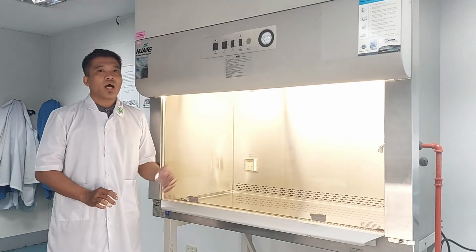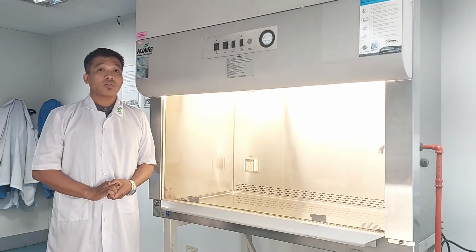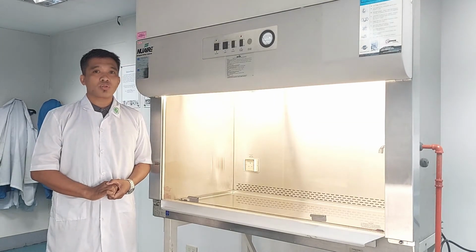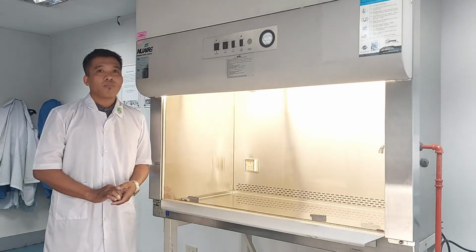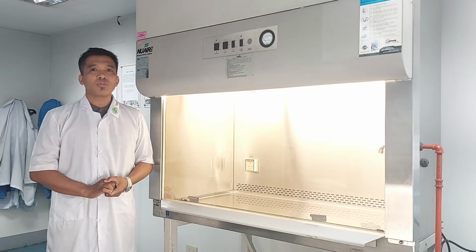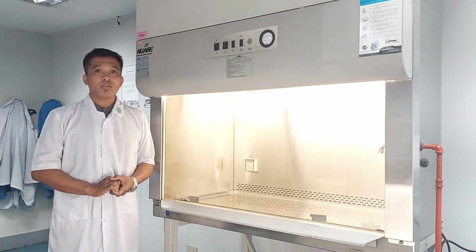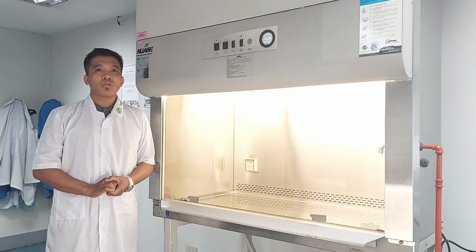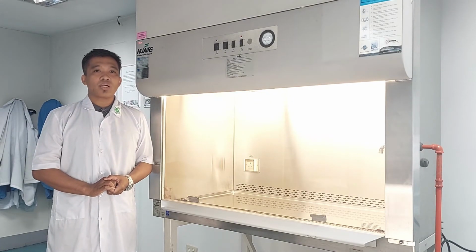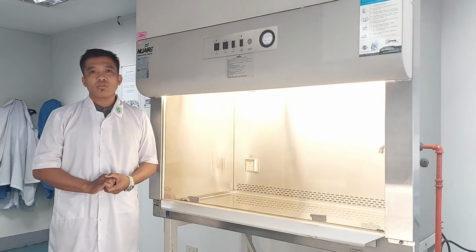Biosafety cabinets are enclosed workspaces with a ventilated hood that is designed to contain pathogenic microorganisms during microbiological processes. Biosafety cabinets might be confused with the laminar hood, as both of these pieces of equipment work as an enclosed workspace, but the laminar hood only provides protection to the sample and not to the personnel and the environment, whereas the biosafety cabinet protects all three.